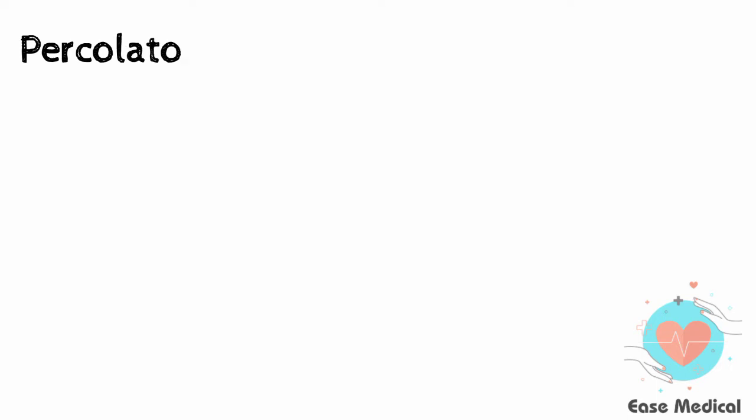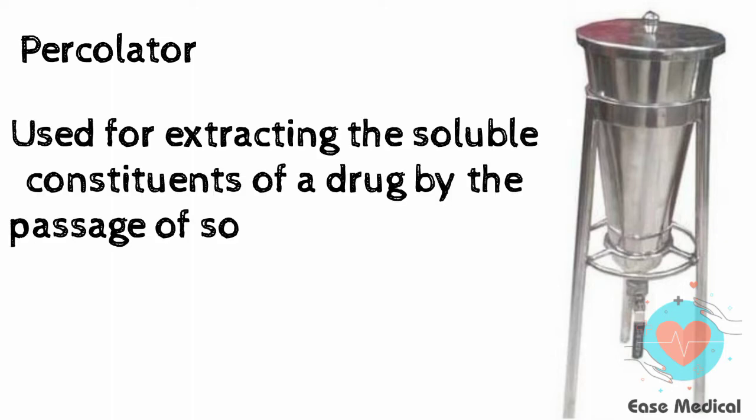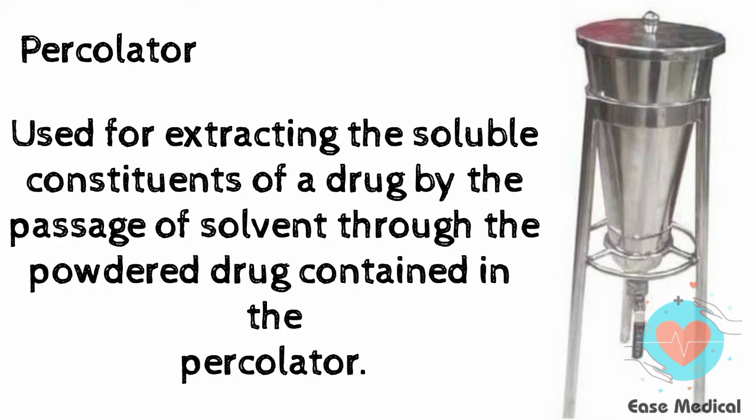Now, percolator. A percolator is a cylindrical vessel with an orifice called the neck at the bottom. It is used for extracting the soluble constituents of a drug by the passage of solvent through the powdered drug contained in the percolator.